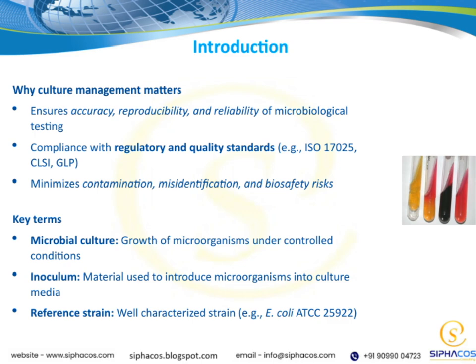Additionally, good culture management helps minimize risks such as contamination, misidentification of microorganisms, and biosafety hazards. This not only protects the integrity of our results, but also keeps our work environment safe.